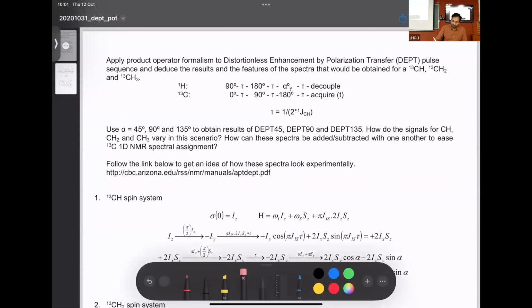You could apply different flip angles concomitantly, meaning that you have an example where a 180-degree pulse and a 90-degree pulse are applied concomitantly. All the examples that we saw before were either a simultaneous 180 or simultaneous 90. But here, slowly, you are able to understand you can change all this. You have the power of changing the flip angle and the phase for different channels and change delays.